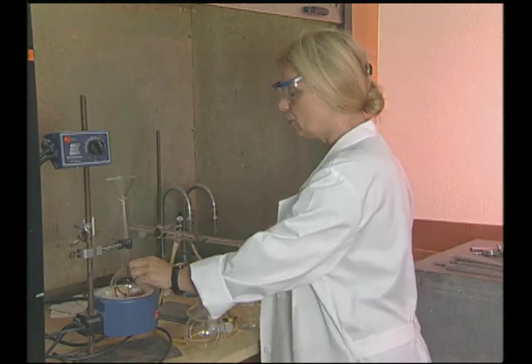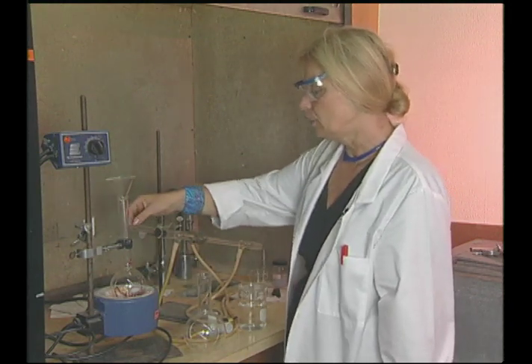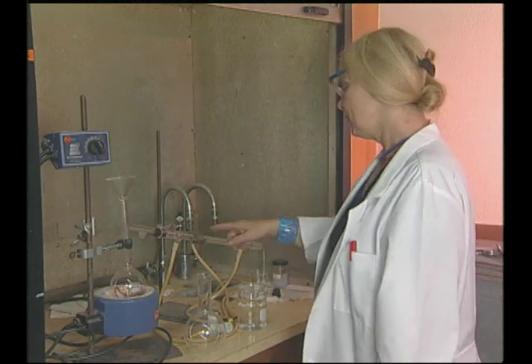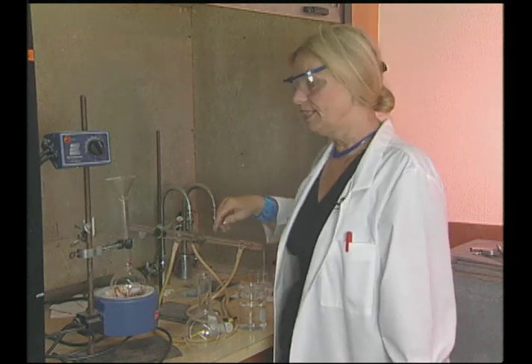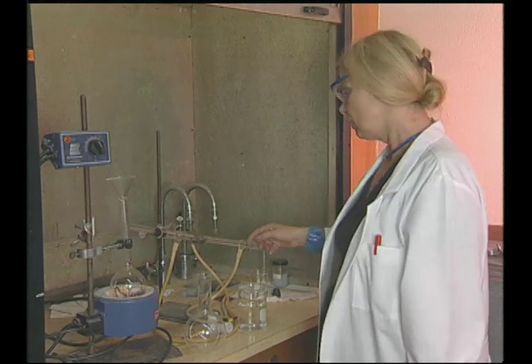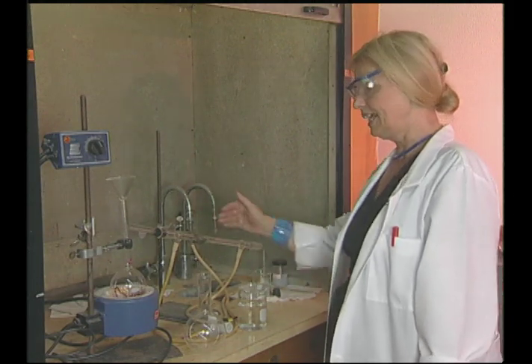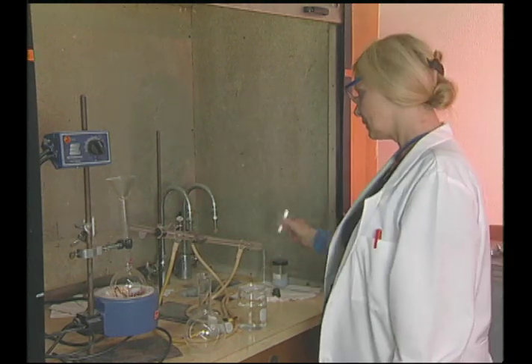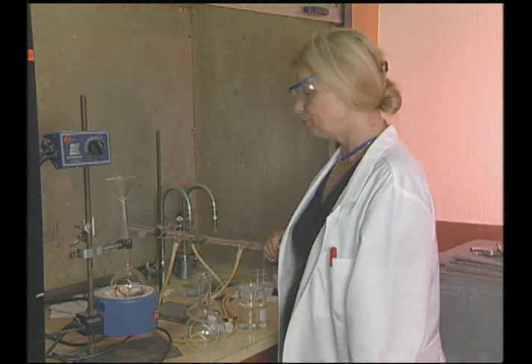We have here our distilling flask, a round bottom flask, already with a side arm that connects to our condenser. The condenser is the one that will condense the evaporated liquid molecules back into their liquid form or physical state, and we will collect the distillate, the recondensed liquid, here in the receiving flask. So it's going to be here on this end of the setup.